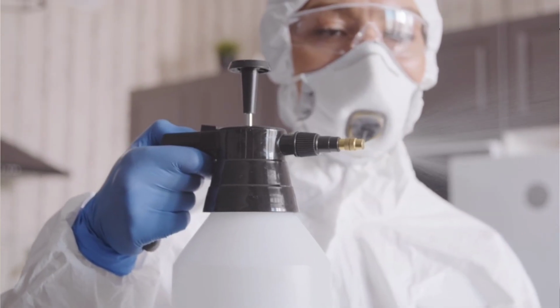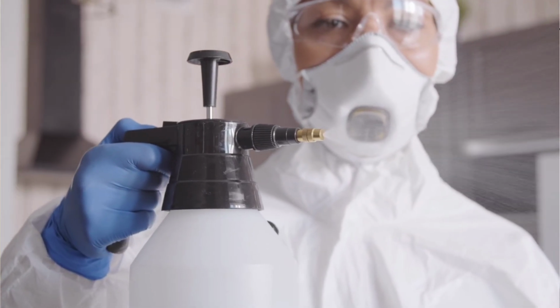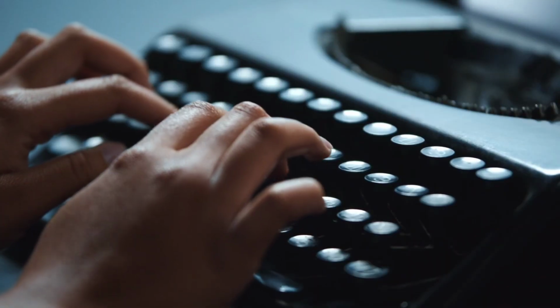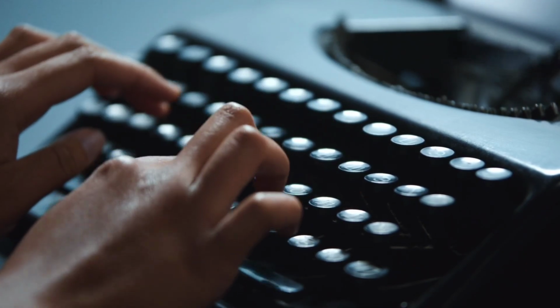For example, for disinfectant preparation and cleaning, in that SOP they should mention which disinfectant we are going to use, what is the concentration of the disinfectant, how to prepare the disinfectant, what is the contact time of the disinfectant, how to clean the floors and walls, and daily cleaning, weekly cleaning, everything should be mentioned in that SOP. This is just an example. Likewise, each and every department prepares the SOP related to the clean room.